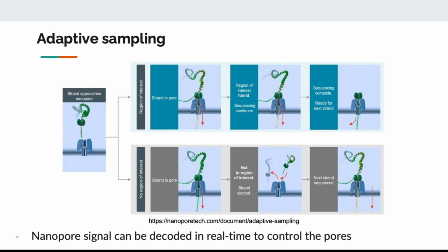Okay. And I don't have a slide here, but just want to mention, if you are interested, that nanopore involves the process of pulling molecules to the pore, right? That molecule doesn't necessarily have to be a nucleotide. So people are starting to explore if this technology can be used to pull protein, so that you can sequence the protein, or maybe detect a different molecule as well. So it's more flexible than other sequencing technology in this regard. And I think within a few years, you might start to see protein sequencing with nanopore in some shape or form. So you can look out for that.